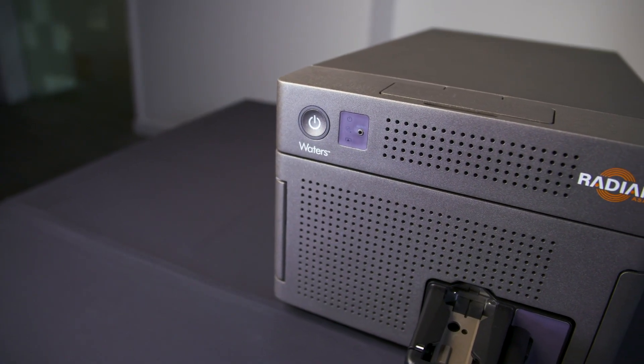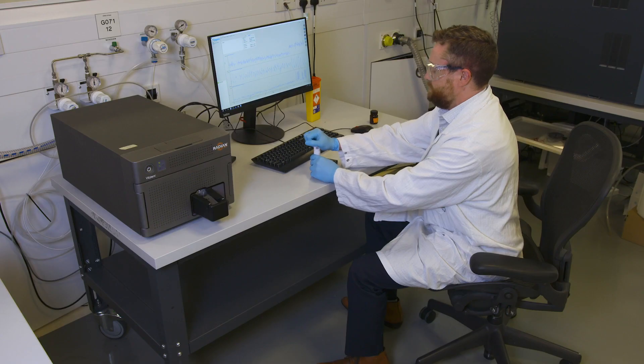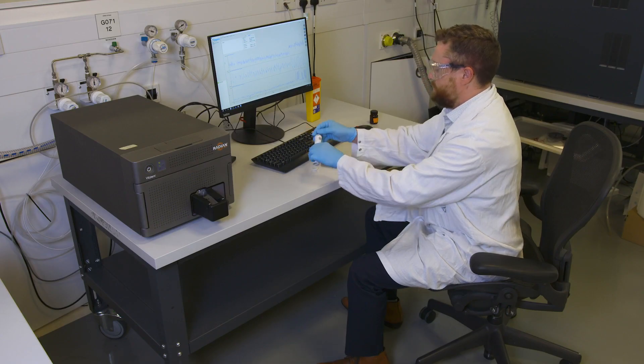With the introduction of the radian ASAP, synthetic chemists will have quick and easy access to mass spectral data for near instantaneous assessment of reaction progress.